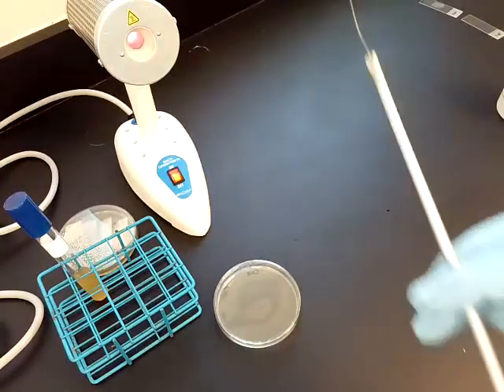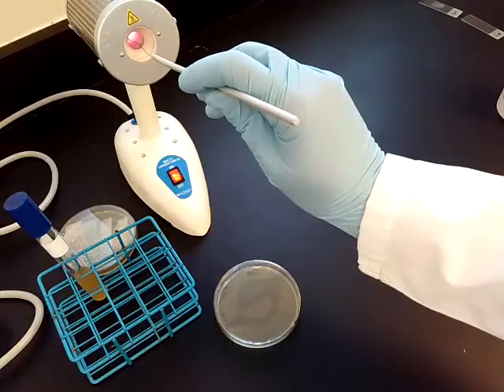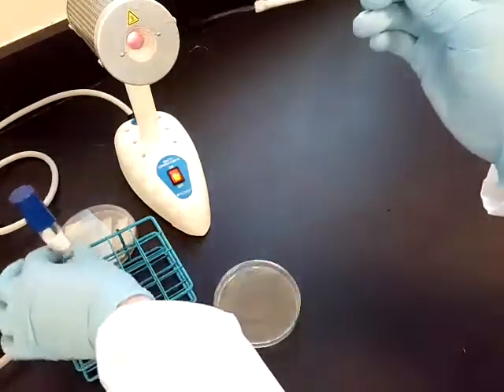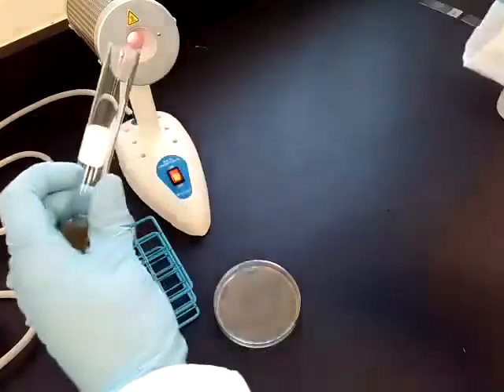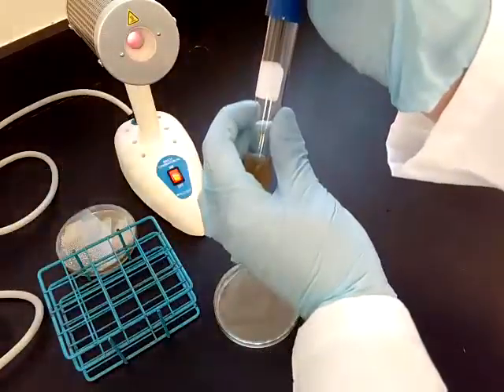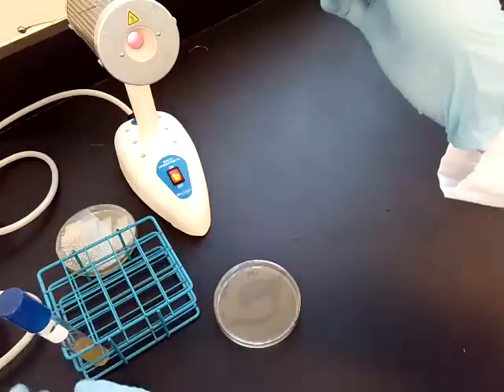I am going to pick up the loop, and I'm going to flame sterilize the loop, and then let it cool off. I'm going to grab the bacterial tube, aseptically take off the cap, and I'm going to swirl it around to obtain a loop full of bacteria. I'm going to put the cap back down and set down the tube.